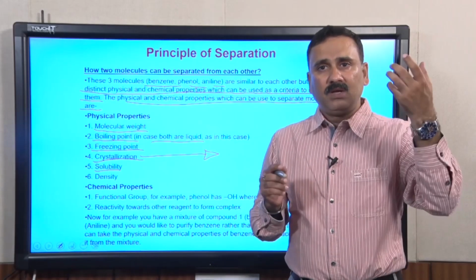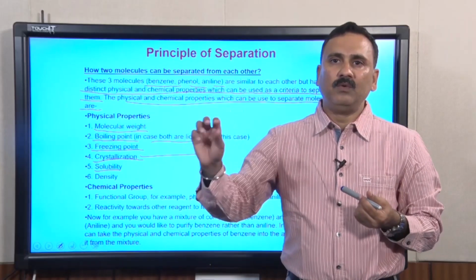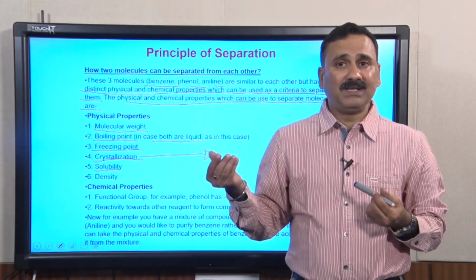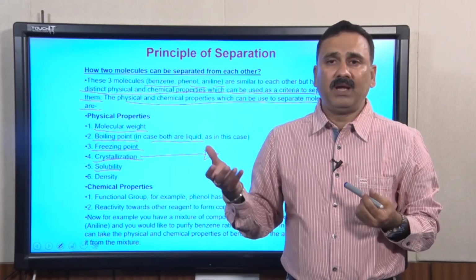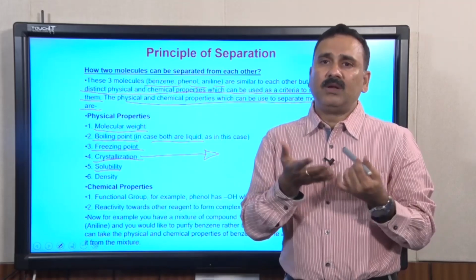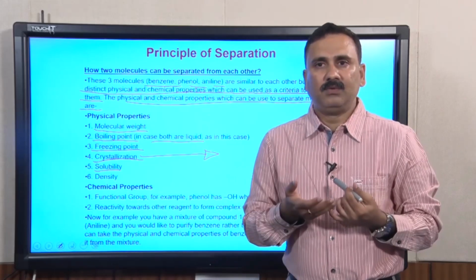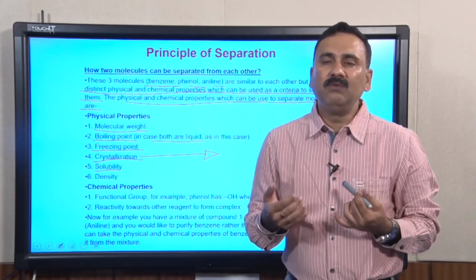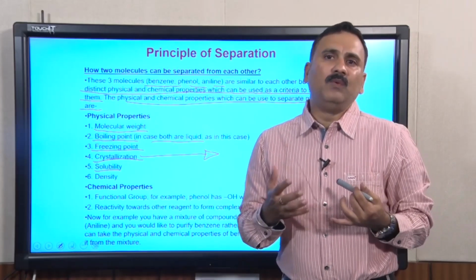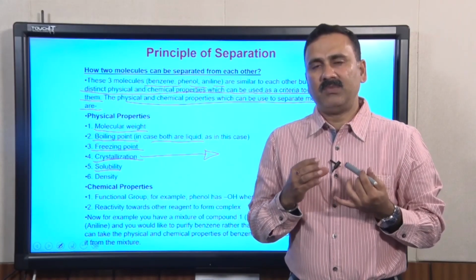If you take a liquid which is a mixture of different compounds, and then bring the crystallization condition of one of the compounds, that one compound is going to crystallize. That crystallized product you can purify simply by filtration, and the rest of the molecules will get filtered out. Then you can wash this crystallized product and recrystallize again, and that will give you very high purity compounds. This is exactly what people do when they are producing very high quality chemical compounds.